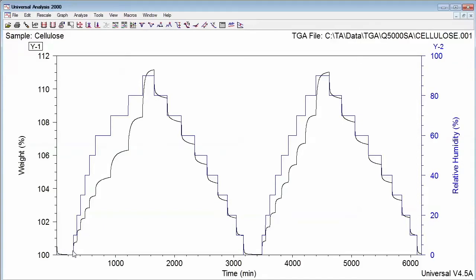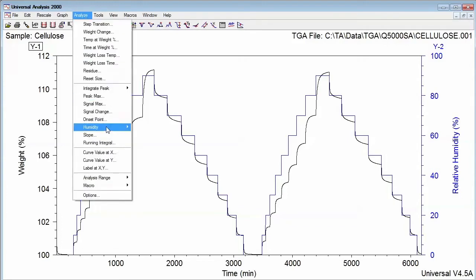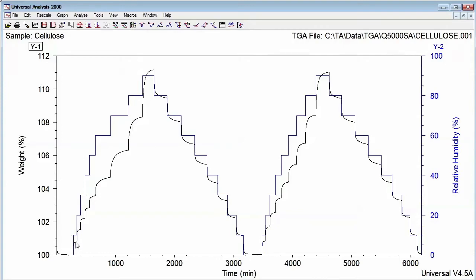This data file can then be further analyzed by selecting Analyze, Humidity, Sorption Isotherm. The last data point for each RH step will be used to generate this plot.